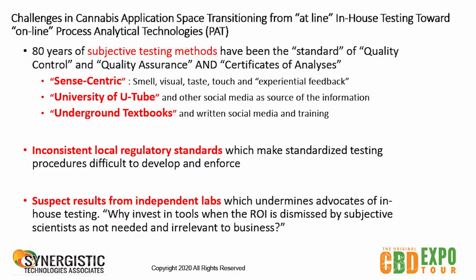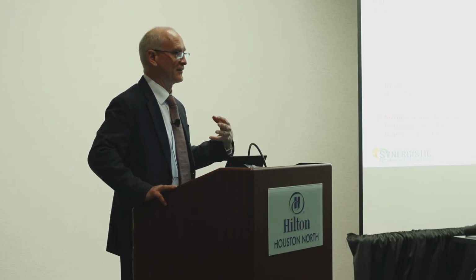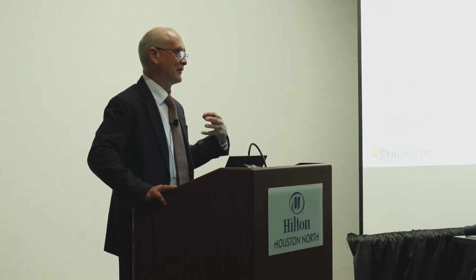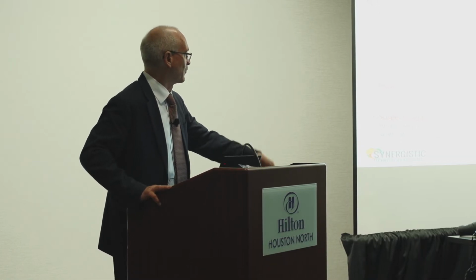We also have suspect results from independent labs, which I would say undermines the need for advocates of in-house testing, because people will talk about sending multiple samples to a lab and they all get a different result, or they send the exact same sample and they get what they would see as widely disparate results. And so why would they invest in a tool when an ROI is just as good from a subjective view? And that's not irrelevant. So we will talk about how to move forward with that.